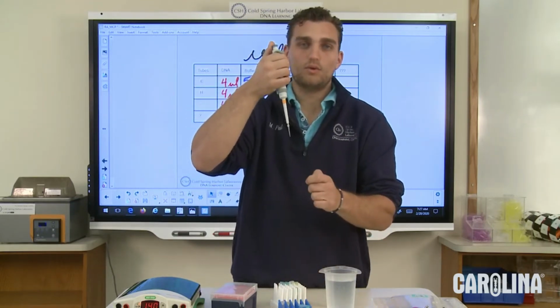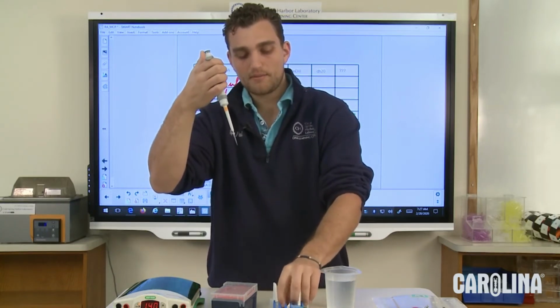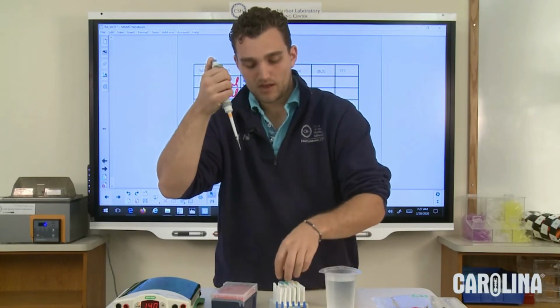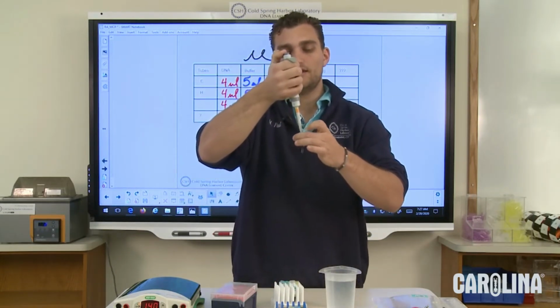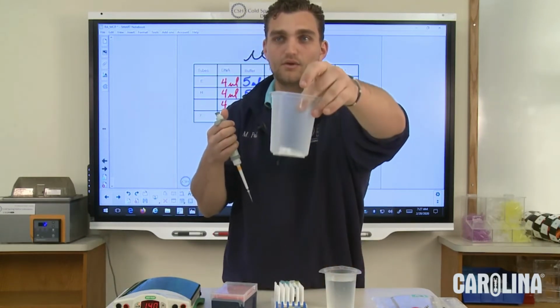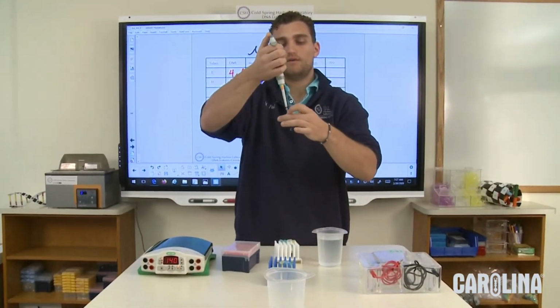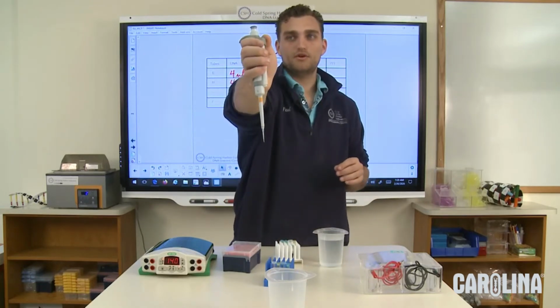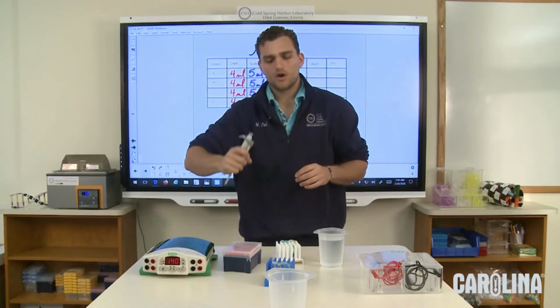Now, what I'm doing here is I'm helping to make sure that my pH will be controlled during this experiment. So that's the point of the buffer, and it's good to just kind of remind you that. Now, I added the buffer to all 4 tubes, so the buffer tube can then be thrown out. I have a little waste beaker right up here. Then I'm going to change my tip, just press down on this, and that tip will shoot right off.